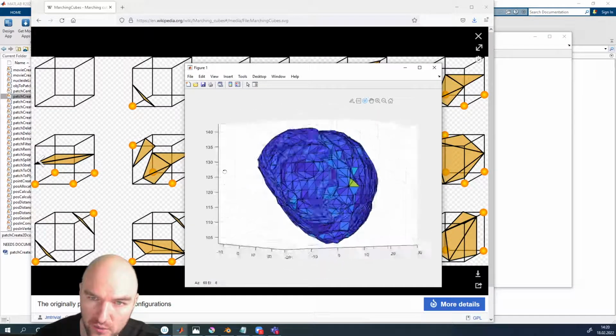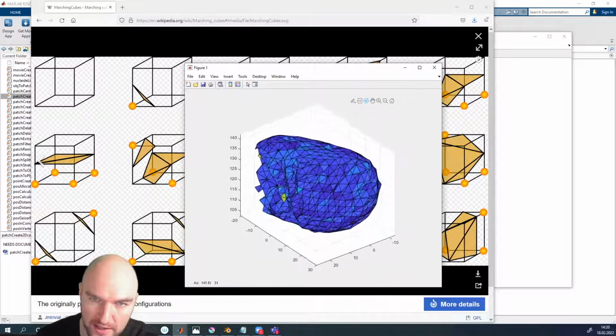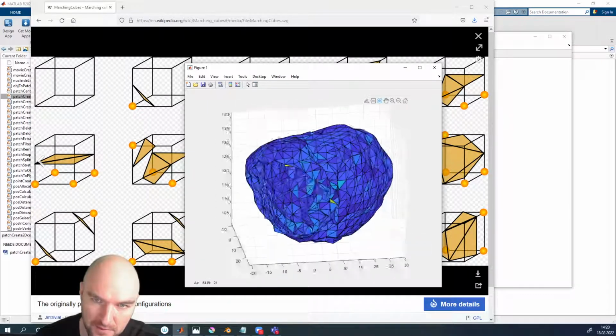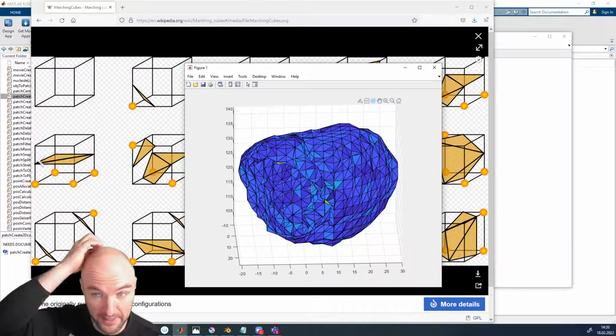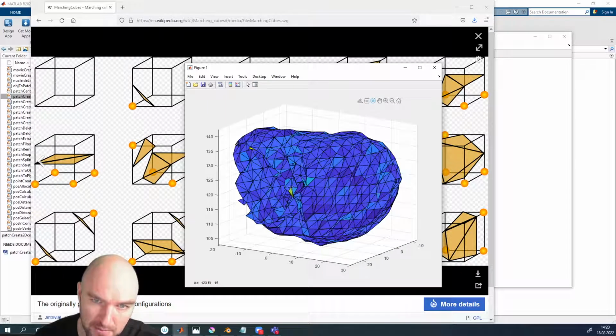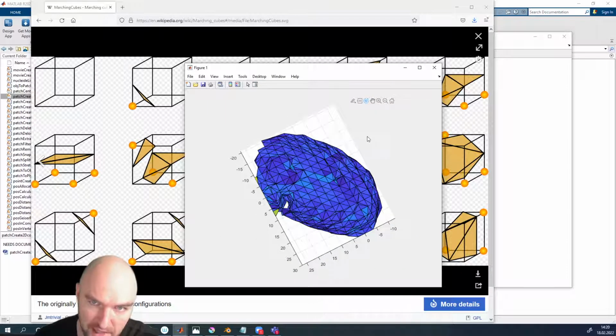And so we are going to work a little bit on that mesh in order to make a better mesh. So that's one aspect of problems that we can have with isosurface meshes. The other problem actually appears right here, and is so-called pinch points.